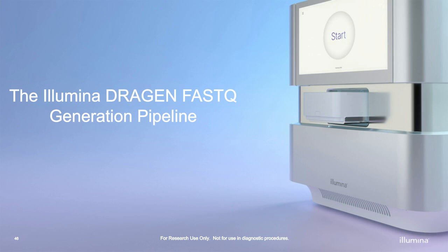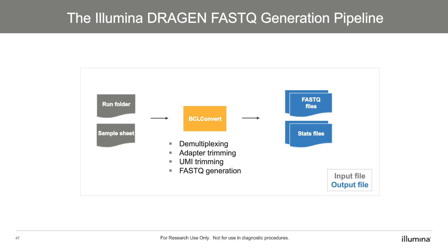Okay, so now that we have an understanding of where to find our output files and what files are going to be present, let's talk in detail about the actual DRAGEN pipelines. First, let's start with the DRAGEN FASTQ generation pipeline. DRAGEN FASTQ generation uses BCL Convert to demultiplex, adapter trim, UMI trim, and generate our FASTQ files. The input is going to be the run folder and, again, that V2 sample sheet. And of course, your output are going to be your demultiplexed FASTQ files and all of the stats files associated.